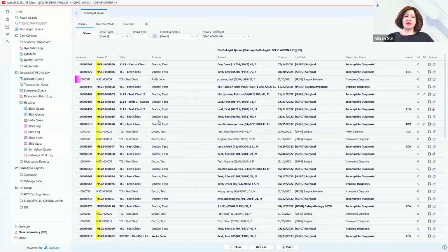or the non-gyns. The way this works is that you can configure any number of buckets for when records associated with that case should turn certain colors. For example, maybe after 12 hours, it'll turn yellow, after 24, orange, after 48, red, etc. So that's a test-based configuration that each lab has full control to customize. And this is just an indicator in the queues of what's aging to get your attention if there are cases that are exceeding their turnaround time.